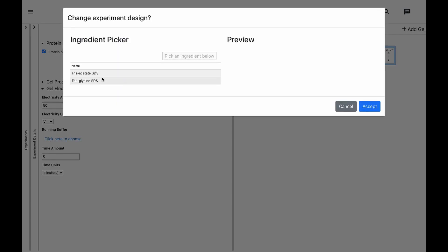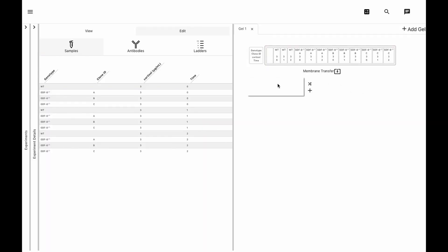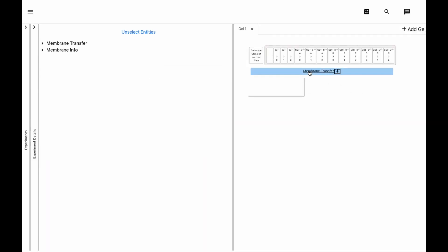Here we'll choose a Tris-Glycine SDS running buffer with buffer details on the right. And the membrane transfer menu lets us specify details of our membrane transfer.